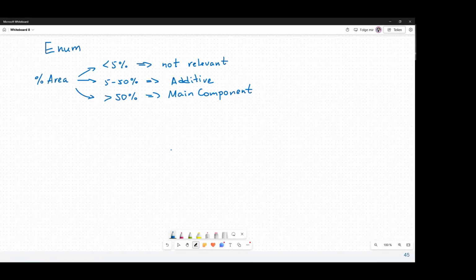And let's write the formula here. Let's say we have here 3 questions: that is the 1st, that is the 2nd, that is the 3rd. We always start with the word enum, then bracket. And then let's write the first question. The first operator is less than, LT. Then bracket, percent area, comma, and value 5. That was my first question. I separate questions with commas.